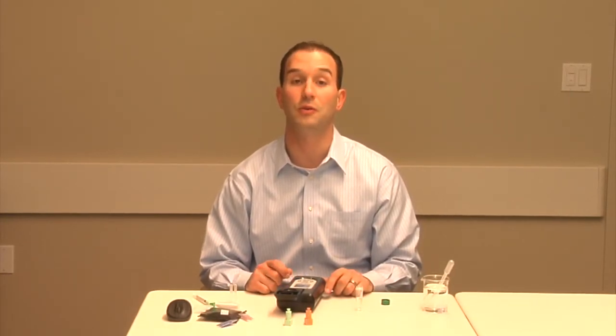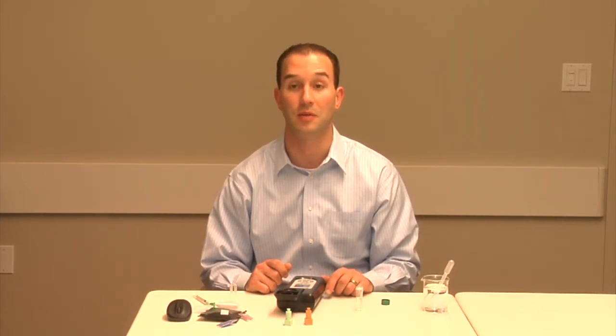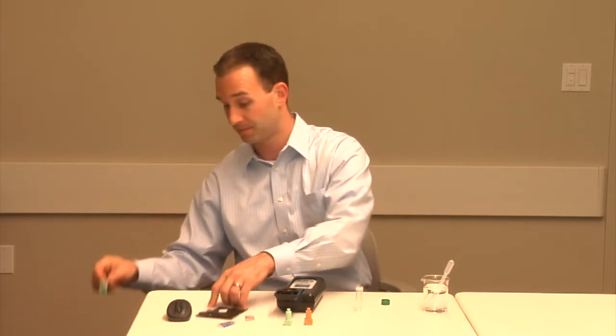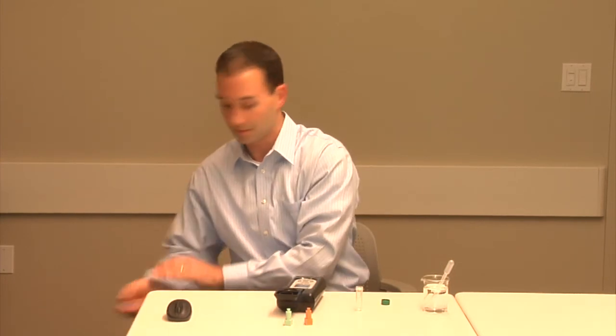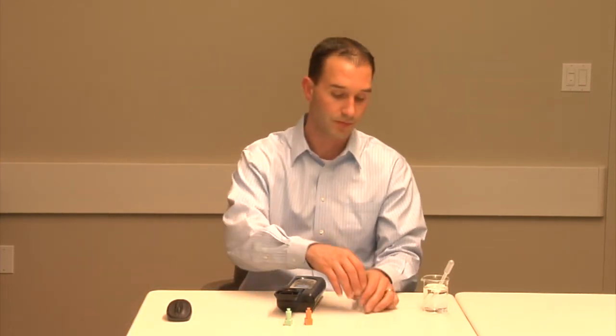After each analysis, it is important to discard all components used during the analysis, including the cuvette, sensor housing, sample tube, syringes, to avoid cross-contamination. No special disposal is necessary. With practice, this test can be completed from sampling to results in about 1 to 2 minutes.